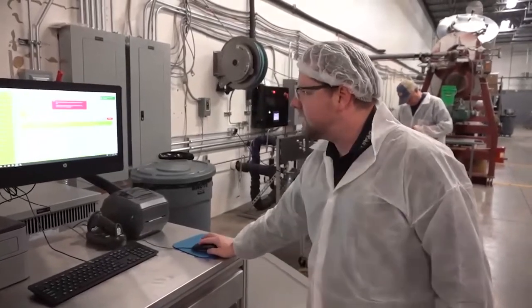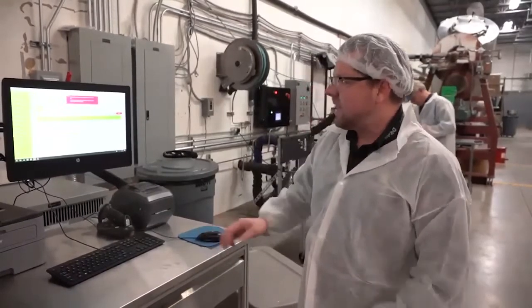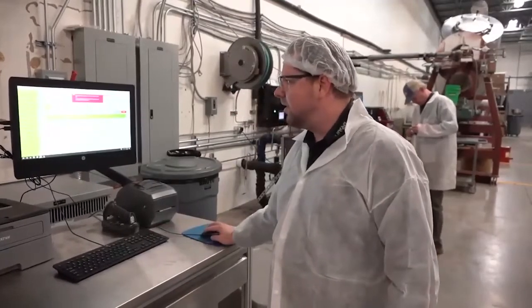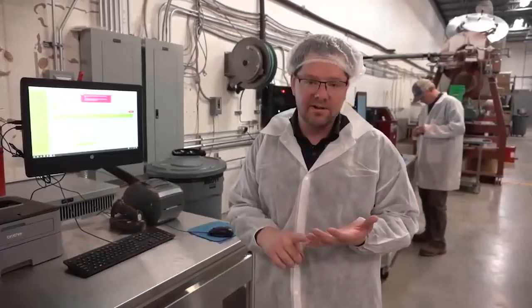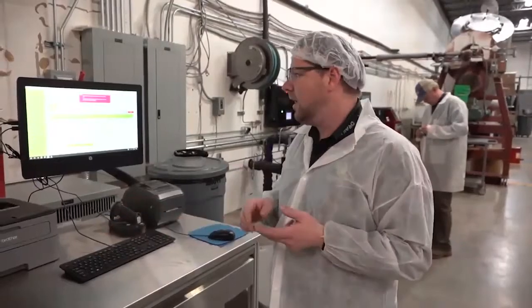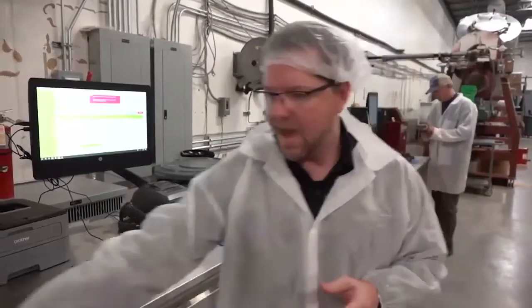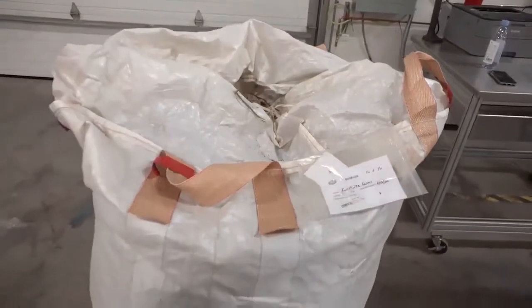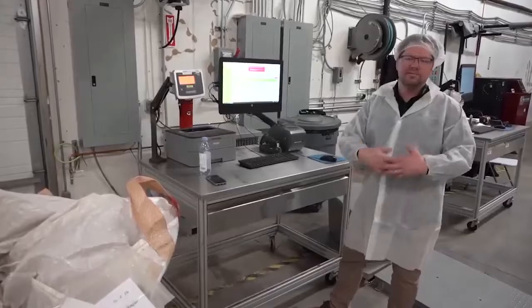I'm going to just press next here. And it goes into basically a questionnaire that has to do with, okay, who's the manufacturer? What is the vendor lot number? What is the material? You can use this to, for example, receive standards and chemicals in, if you want to trace the lot of ethanol in. If you want to trace things like the lot of, obviously, a bag of this stuff, which would be hemp, or if you have different types of trim or whatever. So it gives you a full system.